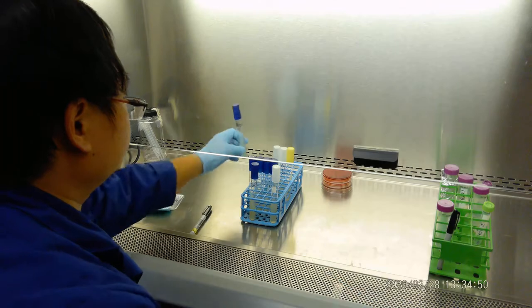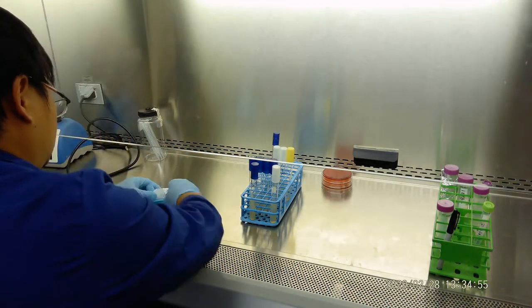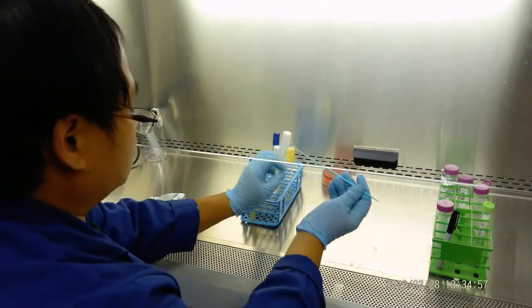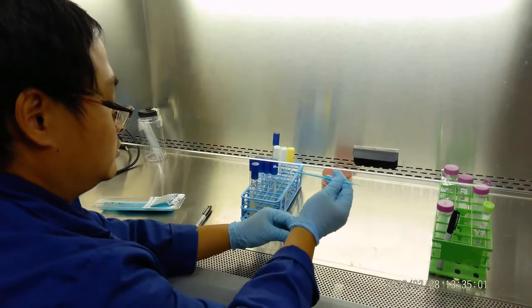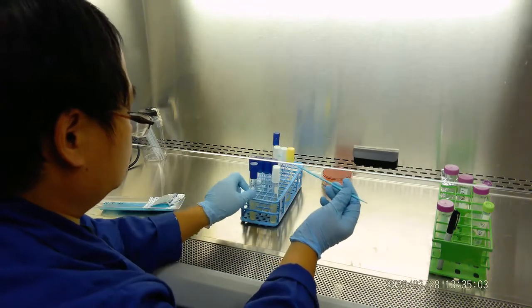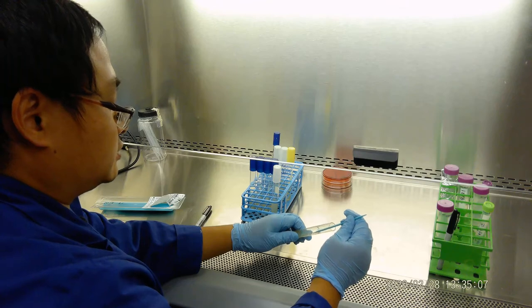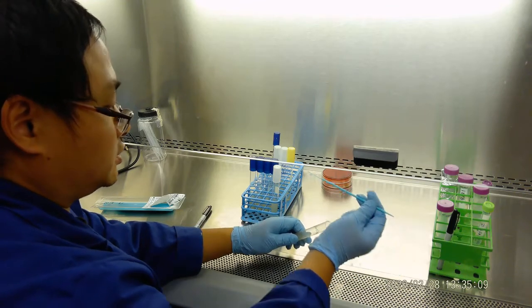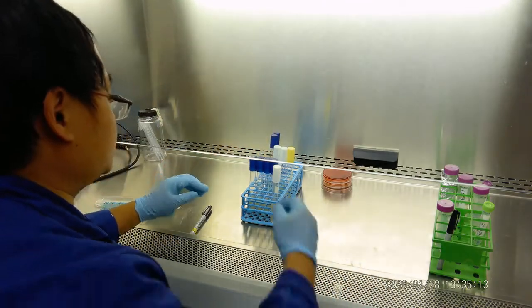Okay. This one finished, we put on the side. And the second one, we also do Serratia, and we do a streak, zigzag streak.